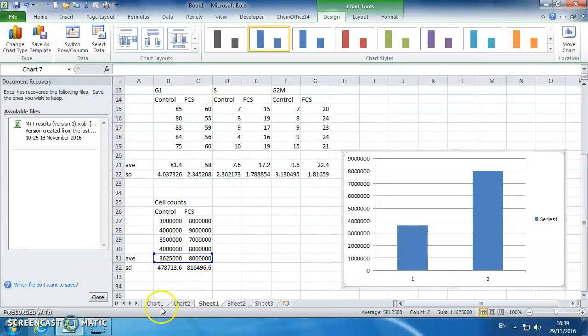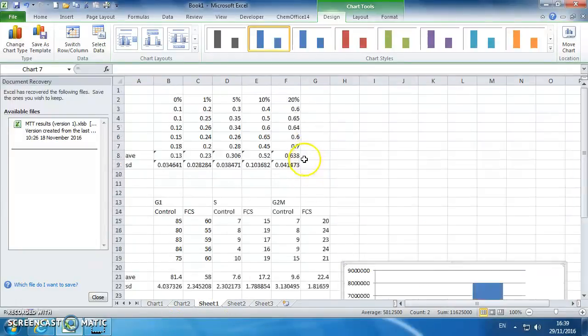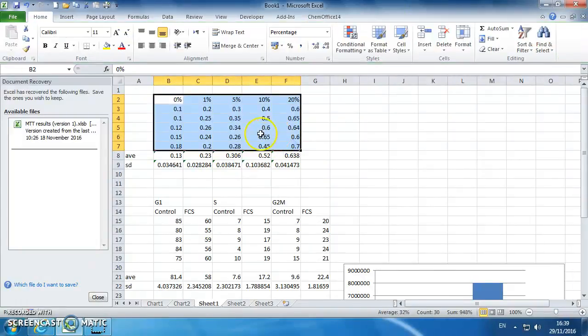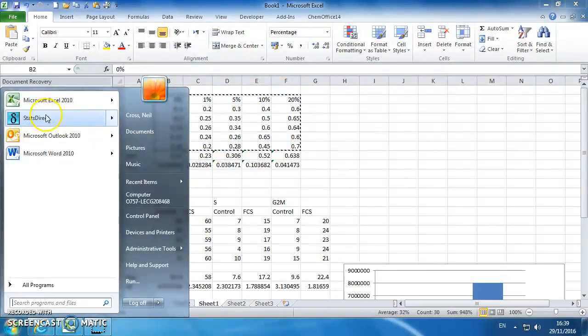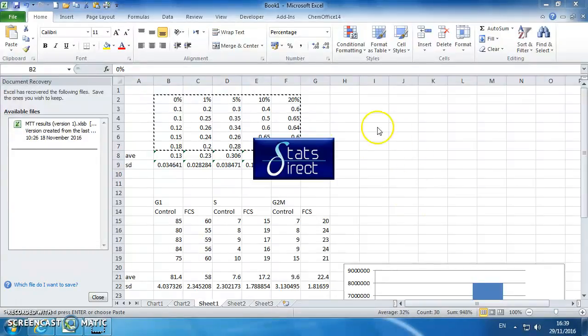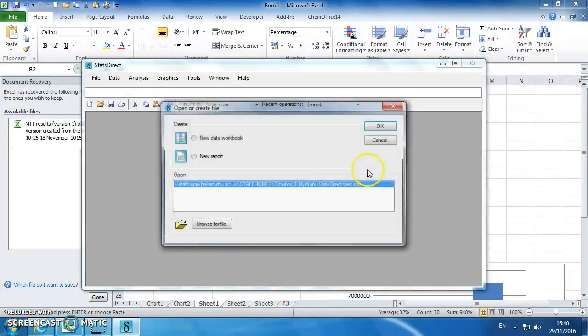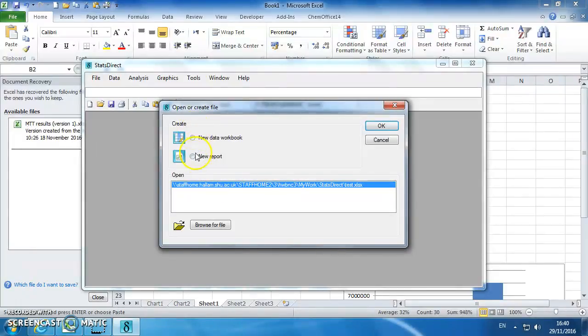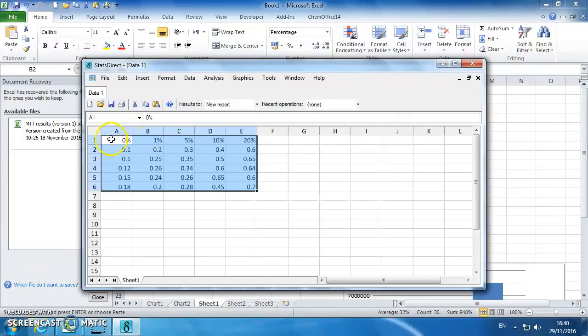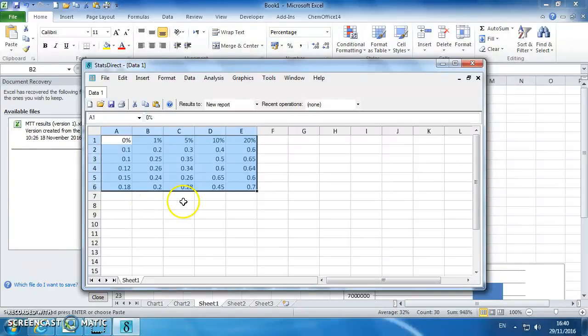Okay, so next thing to do is do stats on this data, which is your data. So we can copy that out and open stats direct. Open up a new data workbook, and we can just dump the data in there. So this is your 0 to 20%. Now the data is either parametric or non-parametric. Unless you've tested whether it's non-parametric or whether it's normally distributed or not, you can assume it's not and do a Kruskal-Wallis test on this, which is what I'm going to do.